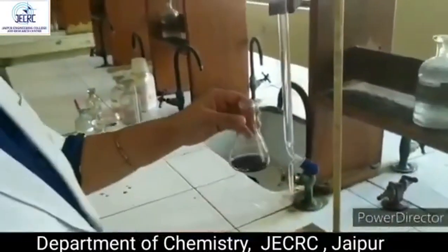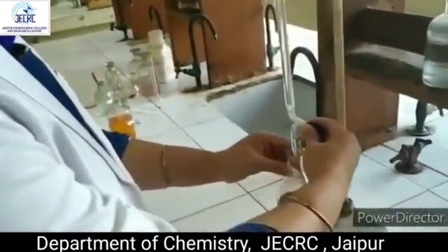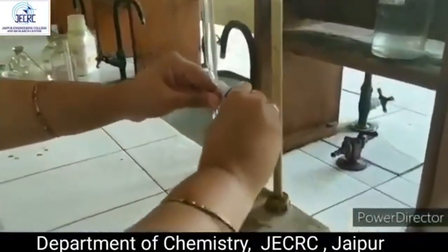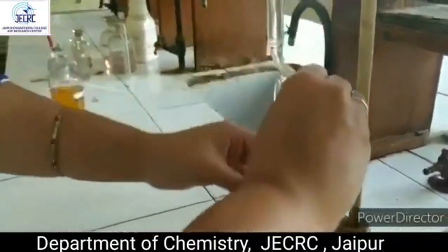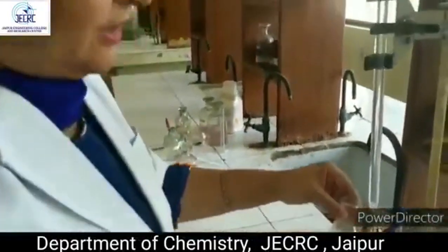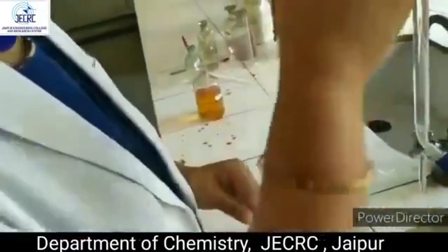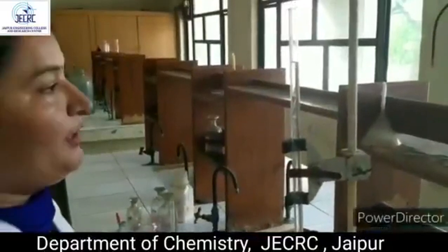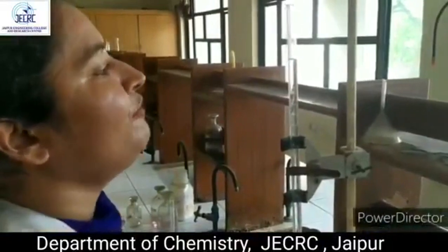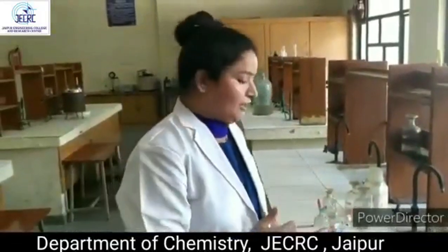Now the solution in this conical flask is titrated with the hypo solution. We'll add the solution slowly so that the reaction takes place. Now as the blue color disappears, the end point appears. The reaction is completed. After getting the end point, we'll measure the reading. It is 0.4. Now we'll note down this 0.4 reading in the observation table.